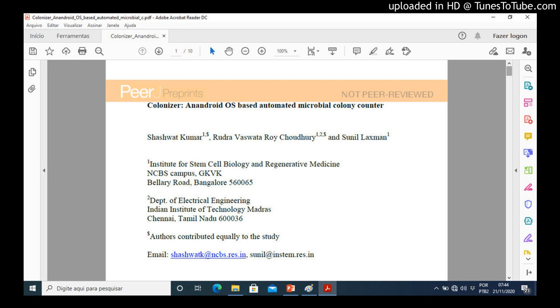Introduction: CFUs, colony-forming units, are estimates of the numbers of viable microbes, bacteria, archaea, or fungi in a given system, and has been a microbiology staple for decades. Counting of CFUs provides information on how microbial cell viability is affected by different environmental or pharmacological conditions.